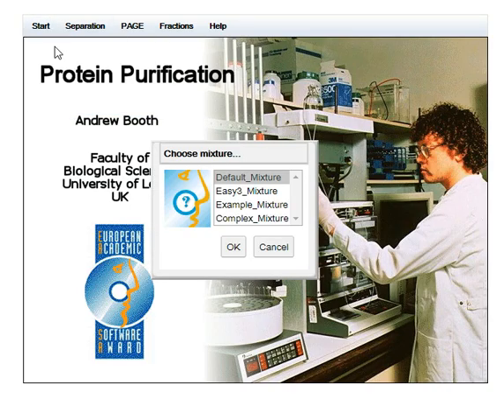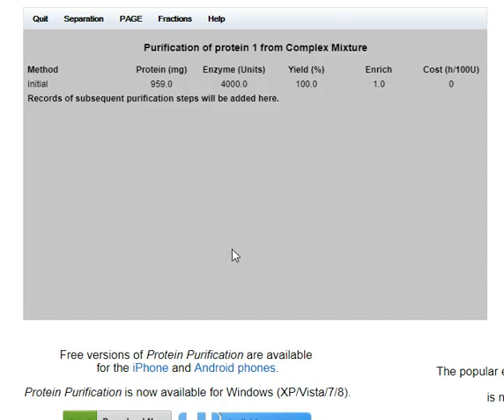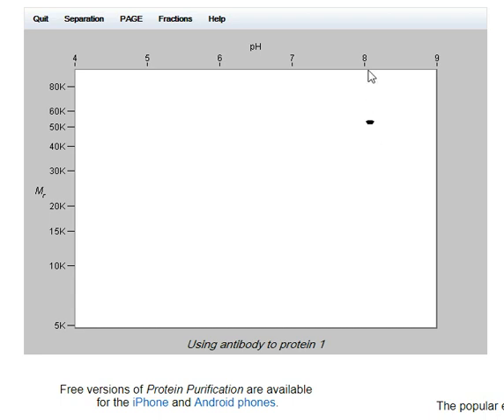Moving on to the complex mixture — I'll stick to protein one. There are 60 proteins here, so I'll focus on protein one with the same basic information. There's 959 milligrams — a large protein mixture. The isoelectric point is just over 8 and the mass is about 55 KD.